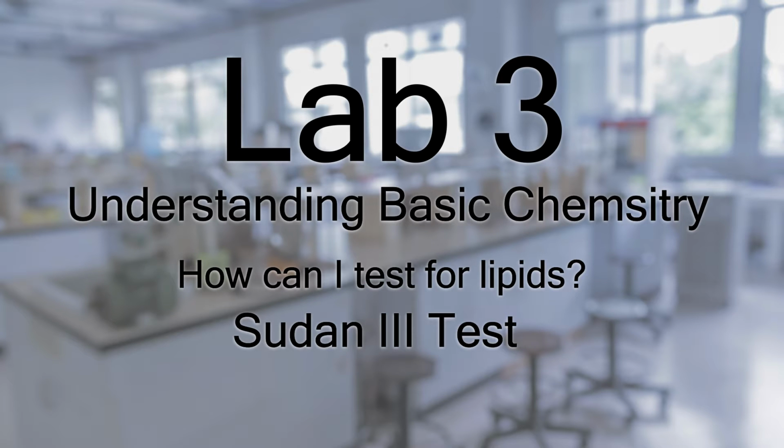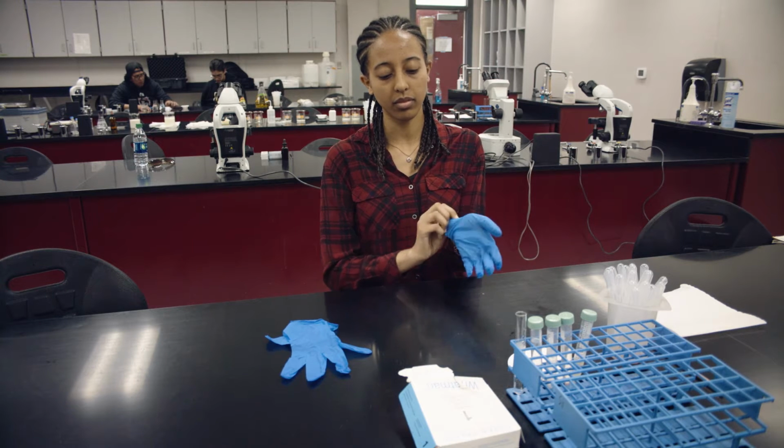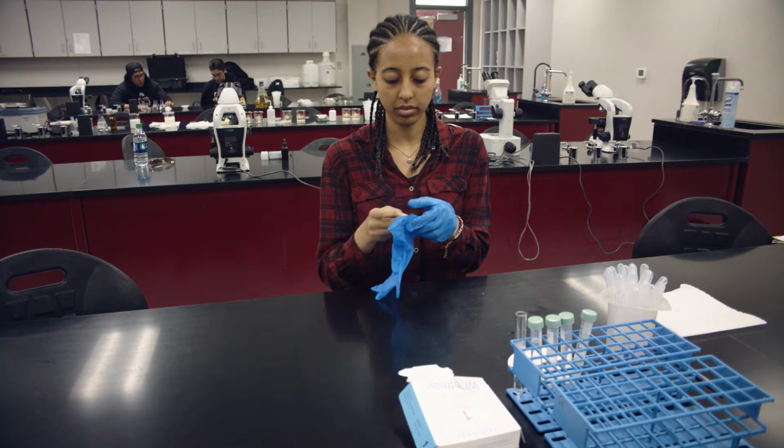When performing chemical tests, it's important that you wear gloves to protect your hands from materials you are using in these tests. Before you perform any experiment, you should mentally review the following.